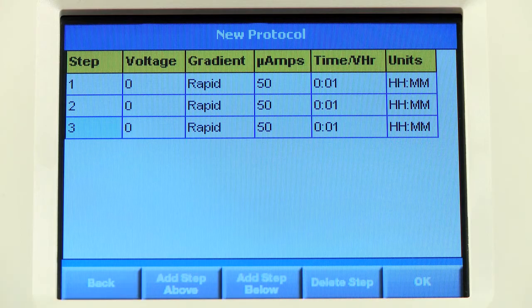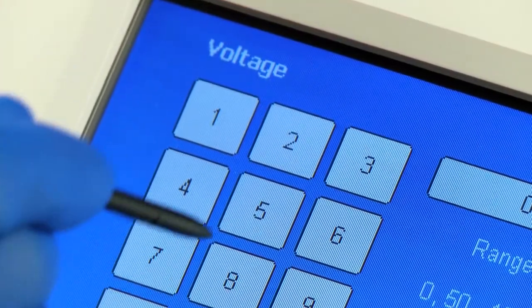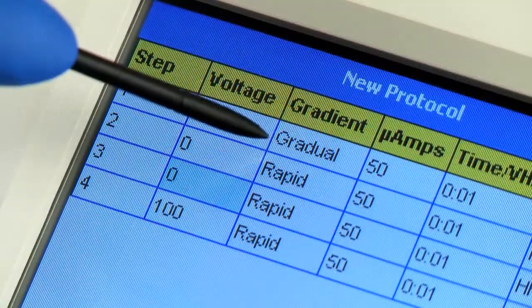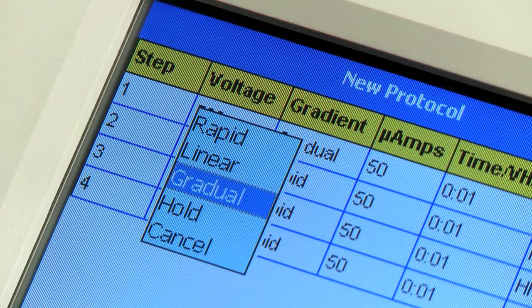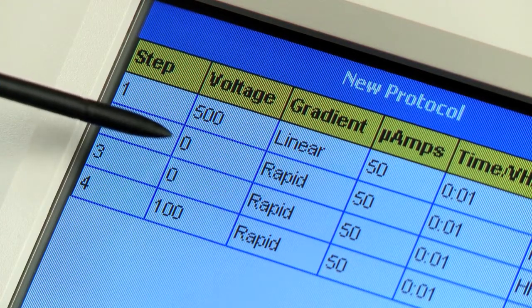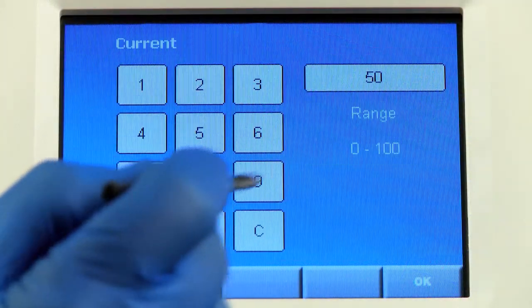To change the parameters, click in the boxes. You can set the voltage, type of gradient, and current for each step.